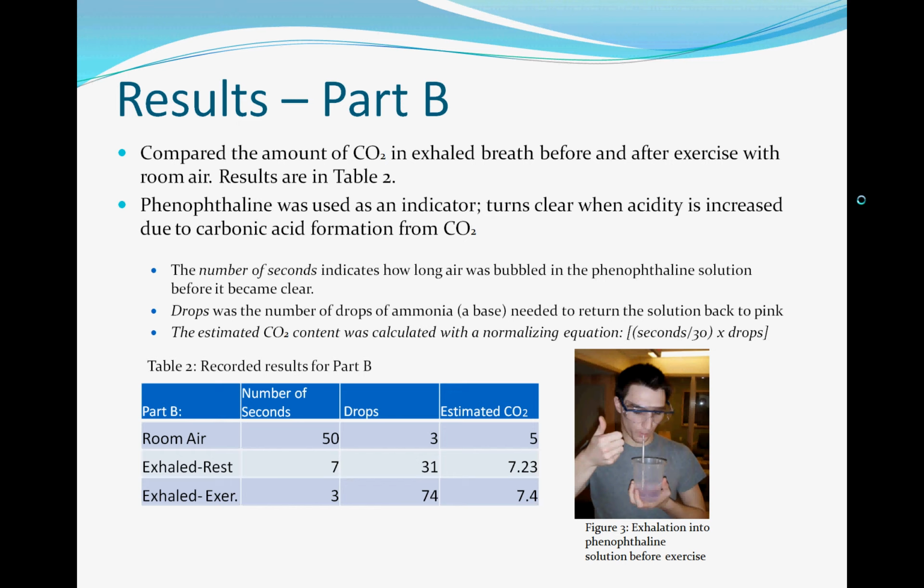Experiment B tested the carbon dioxide concentration in exhaled air before and after exercise, with room air as a control. The results for this experiment can be seen in Table 2. Phenolphthalein was used as the indicator in this test. A phenolphthalein solution becomes clear when it is acidic. This acidic concentration increases during carbonic acid formation when exposed to carbon dioxide.